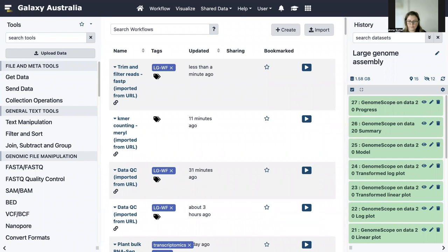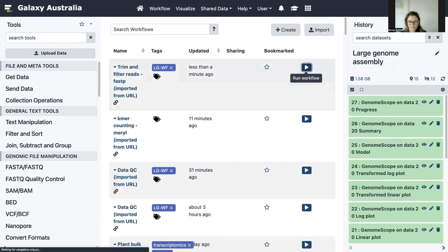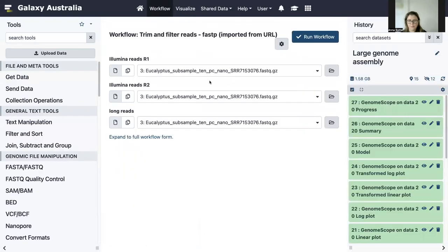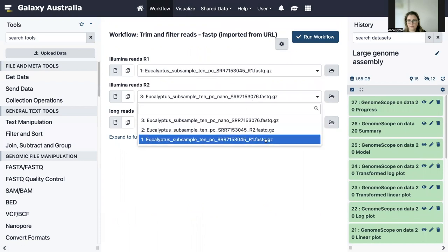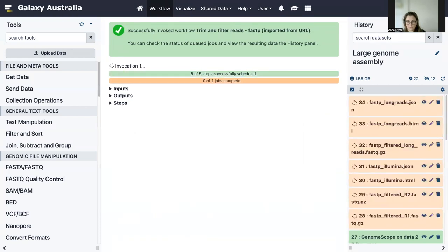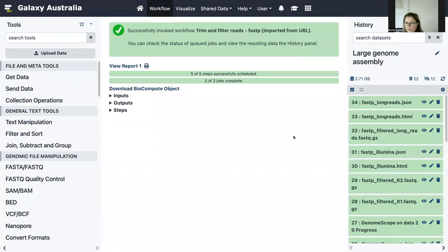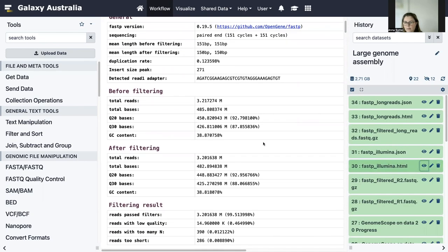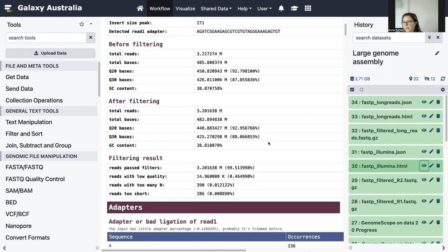Now we will run the step for trimming and filtering the reads. I've already imported this workflow and we can just run it here directly. We need to give it the correct inputs: check it's got R1 here, R2, and the Nanopore reads. Then we can run that. The tutorial discusses in more detail what settings have been put in there for the defaults, but note that you will most likely want to change some or all of those existing settings if you're working with real data. Let's have a look at some of our results — we'll have a look at the FastP results for the Illumina reads, and we can get a lot of information there about the results of FastP from both the trimming and the filtering done in this workflow.